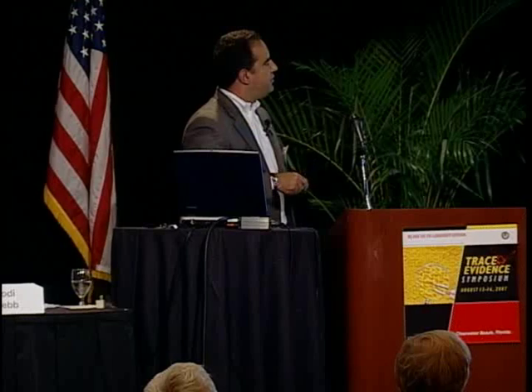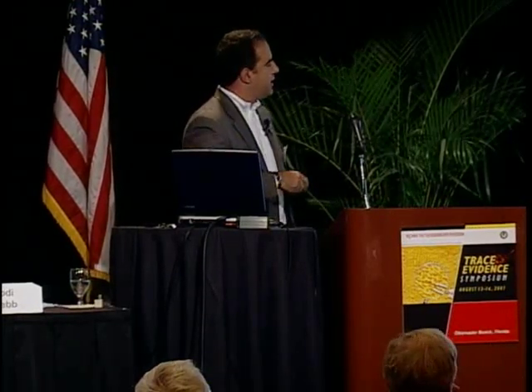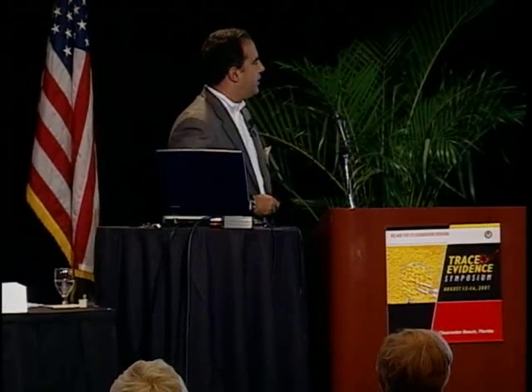So there's lots of things that affect reproducibility in the LIBS experiment. Like I said, we need more than 50 shots. Laser stability is even more important than in laser ablation. How we focus that laser beam onto the sample surface is also important. We want a very nice, tight, even focus. And then how we observe the plasma, how we observe the light coming off, is also very important.